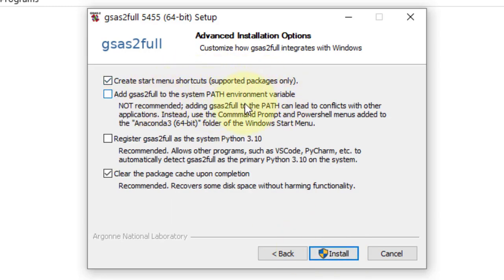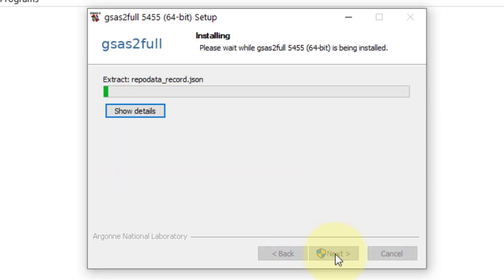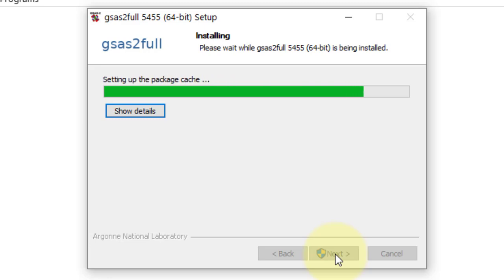To link GSAS with Anaconda Python we need to select this option, otherwise we proceed by clicking next. Now the GSAS installation in Python 3.10 version has started.